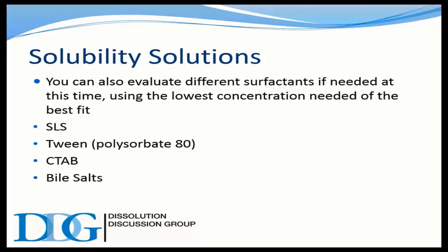No, that's a good point, because most of the BCS is in terms of a maximum dose going into 250, and maybe that carries over into the shake flask solubility method as well. The shake flask is determining saturation and solubility from one standpoint. With the BCS, you're just seeing, are you meeting a certain standard of solubility? So it's a little different concept for the two. Okay. And the other question is, we've already answered it.